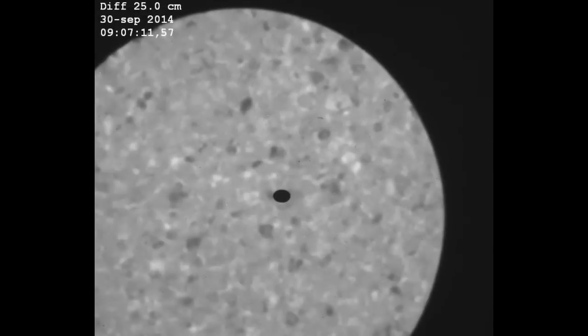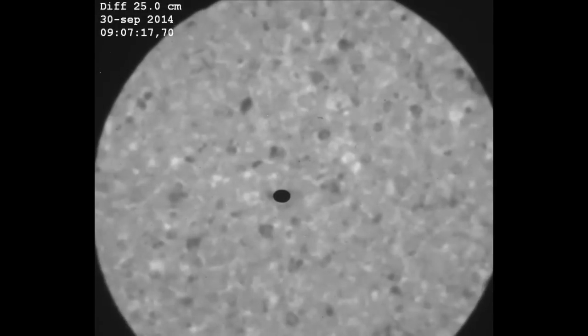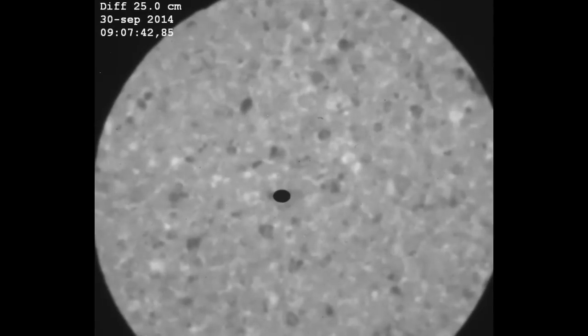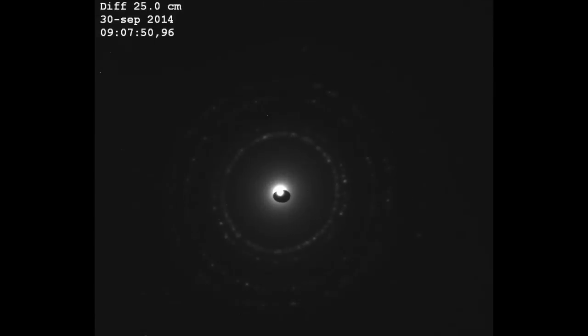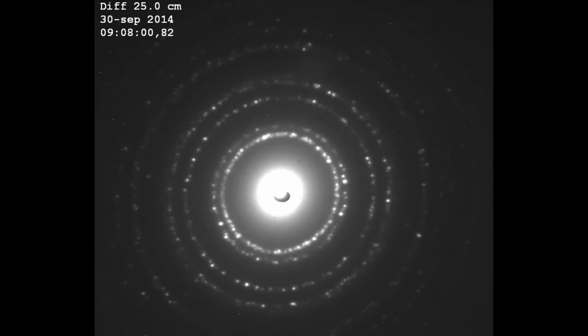You can select a smaller region instead using the selected area aperture. I go back to the bright field image now, and I put in the selected area aperture. You see it is a small disk that selects out a region of the sample, and from this region we will take the electron diffraction pattern. Here you see the electron diffraction pattern again — because we have selected a smaller region, fewer crystals contribute to the pattern, and the circles will be less apparent.